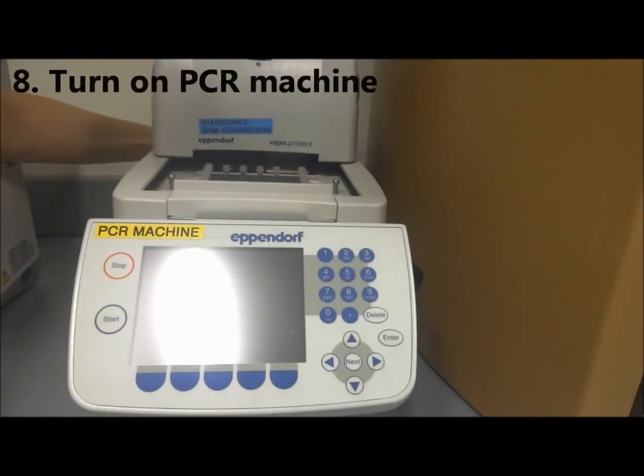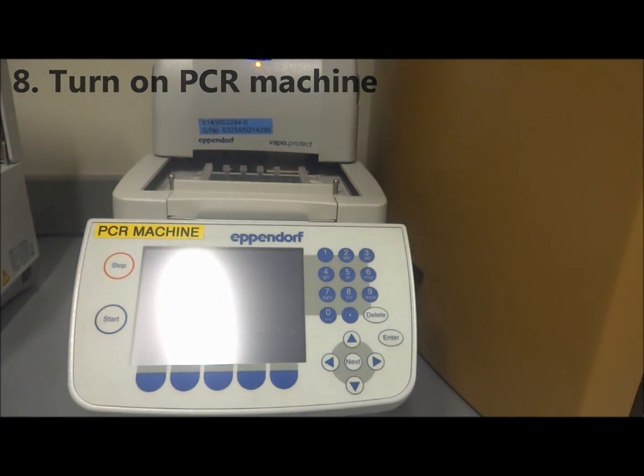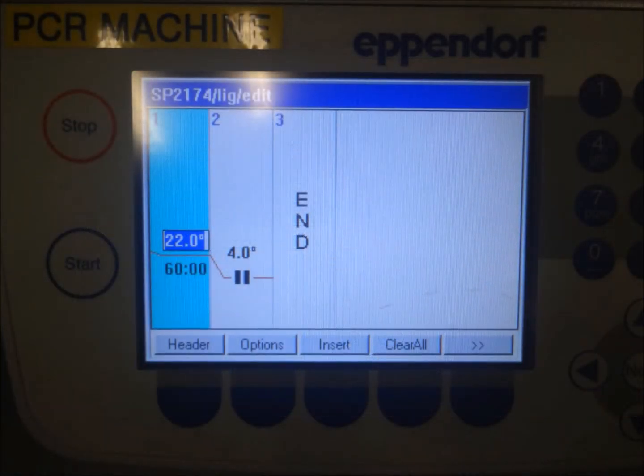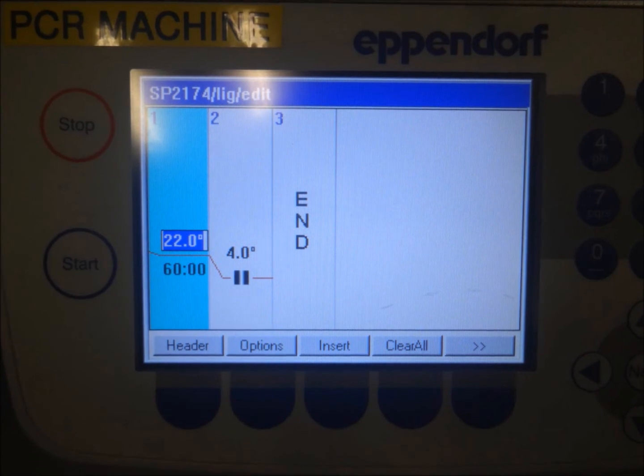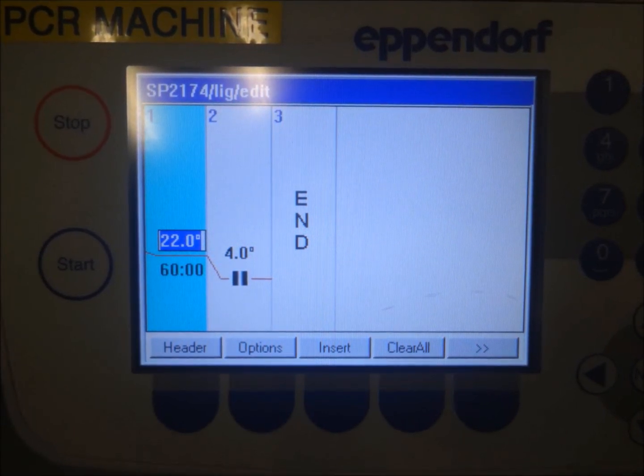After the required components are added into each reaction tube, turn on the PCR machine, allowing for ligation to take place.